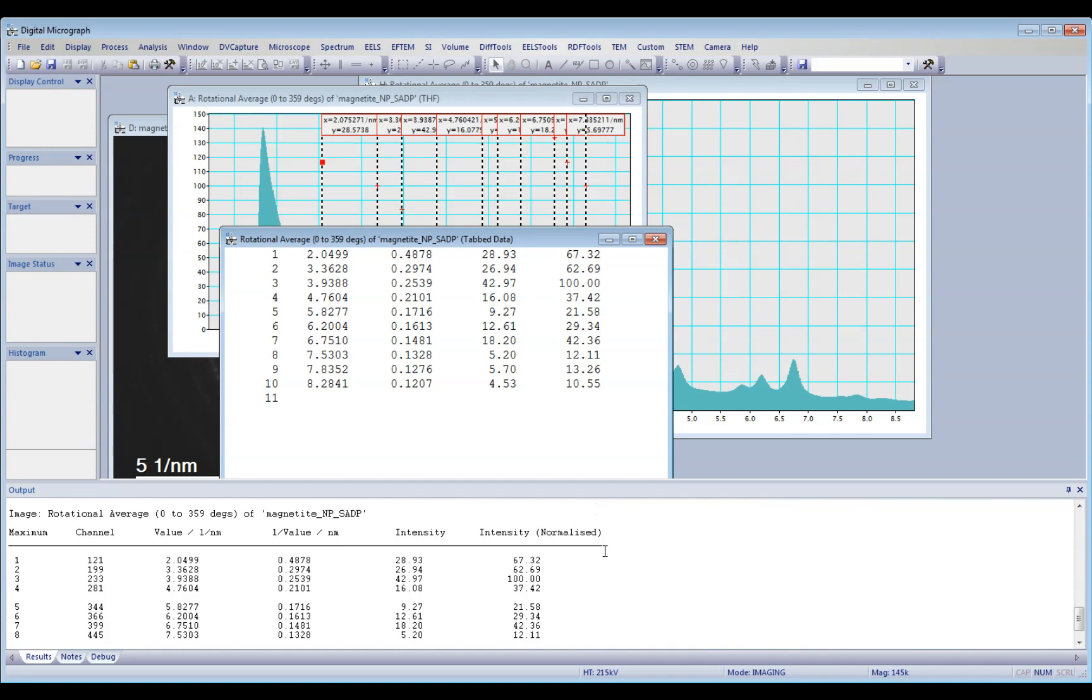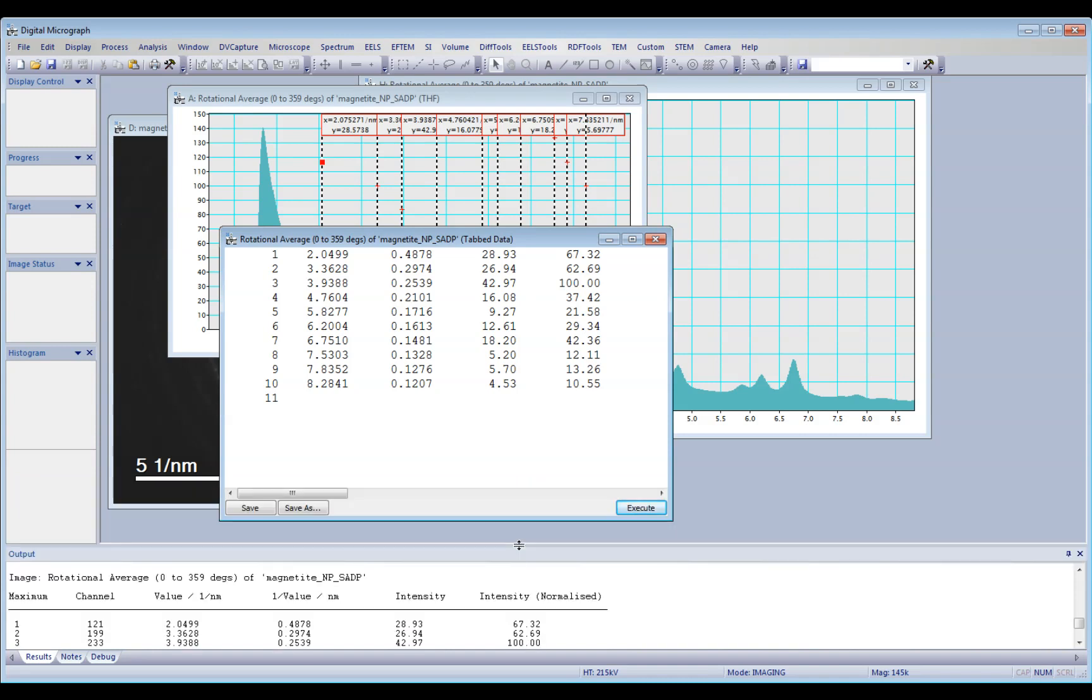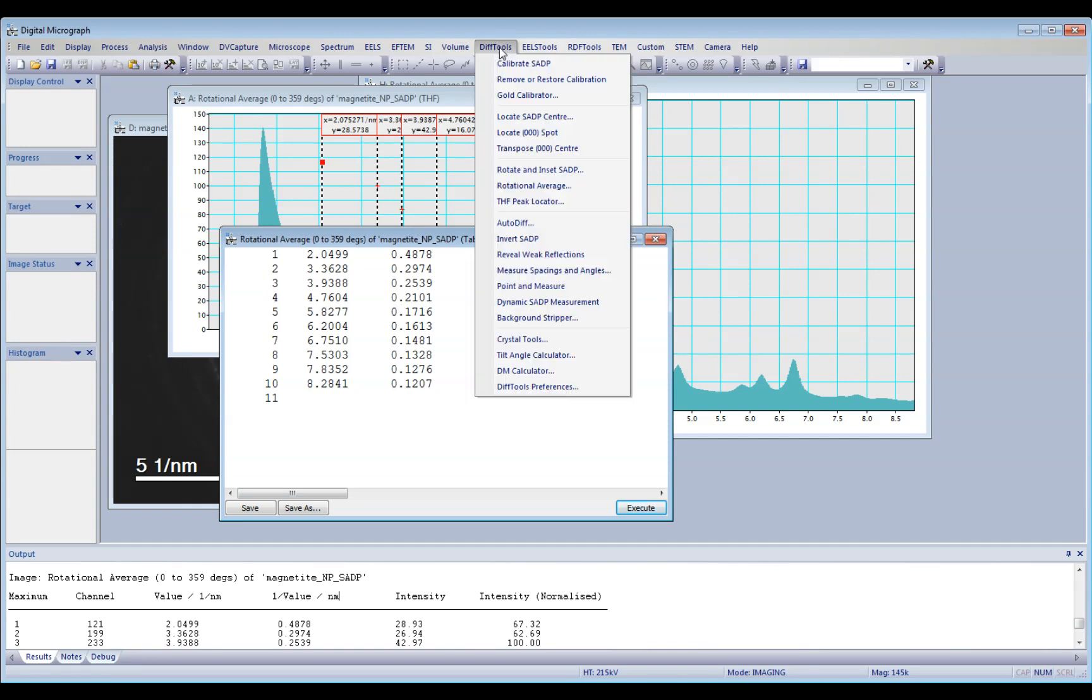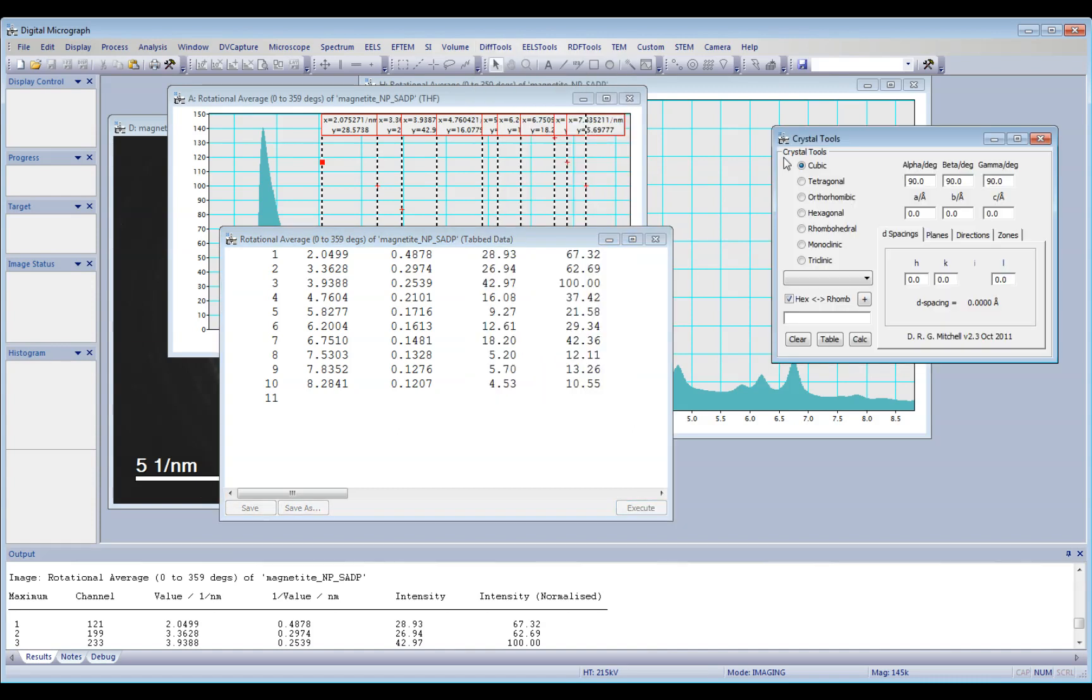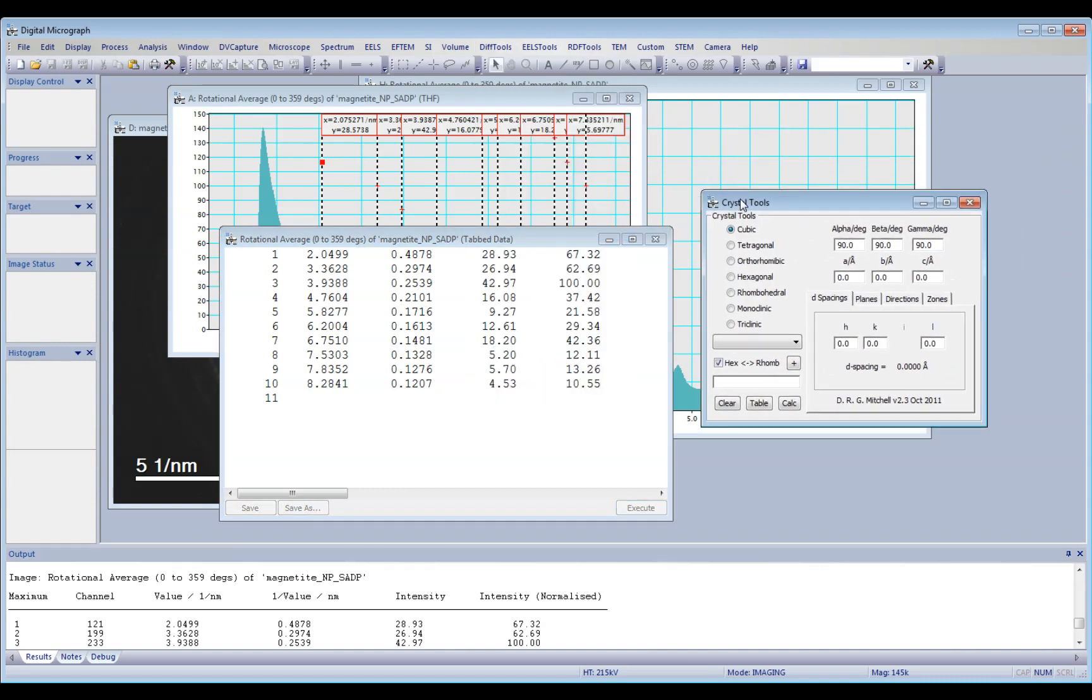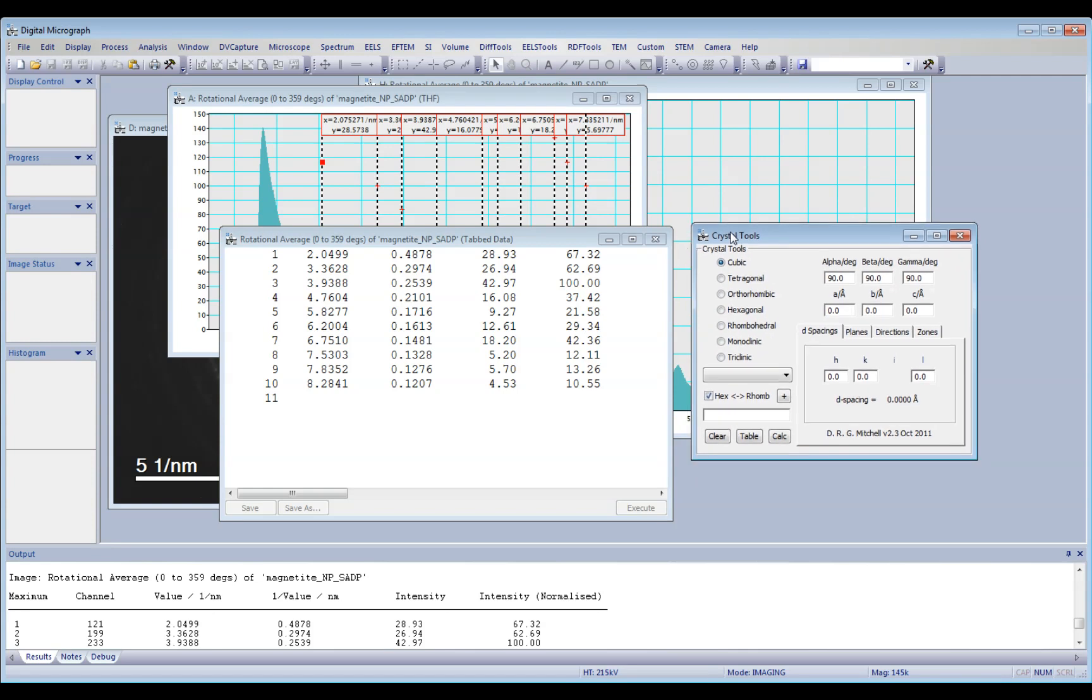So now, I'm going to use another tool down under the diff tools menu bar, that's called crystal tools.